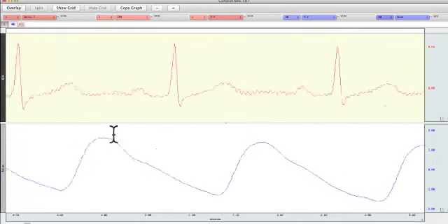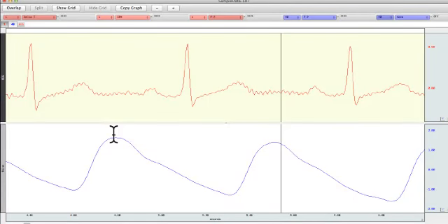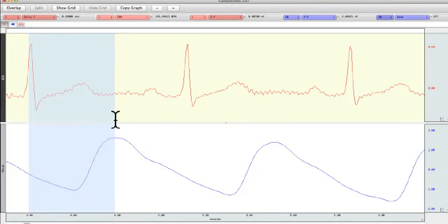So we set it to 3 different pink channels, measured 3 different values up here. Notice I used delta t from the pink channel to know the duration from the pink channel to the blue channel. And that's because delta t is the x-axis, and it always is the x-axis. It doesn't matter which of any of your inputs you're reading. Delta t is always along here.